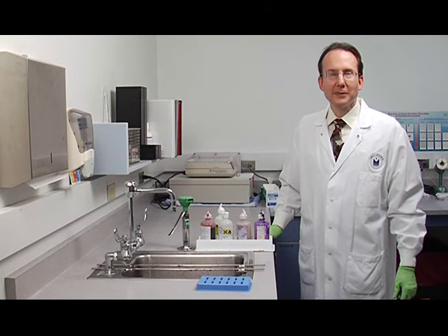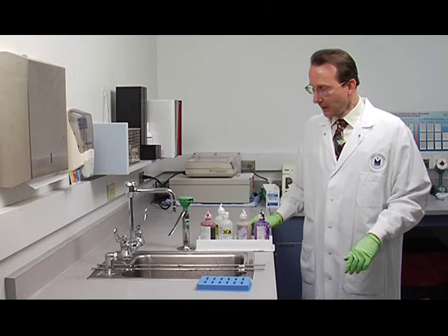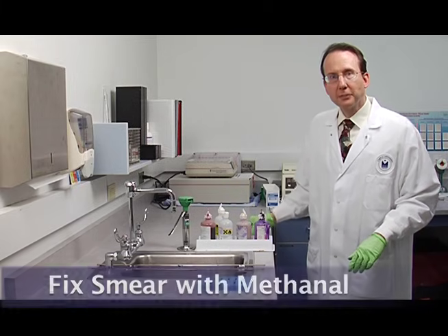Now I'll show you how to perform Gram stains. The first step is to fix your smear with methanol.